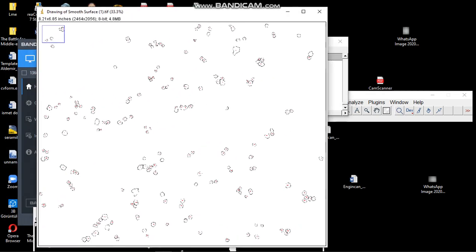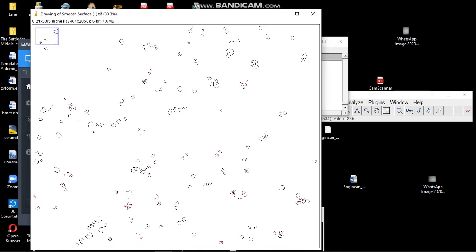Why do we have such differences? We analyzed that in our lesson. In our lesson, as I remember, we had two different specimens in one of the articles, one with a smooth surface and one with a roughness surface, and we were looking at their cell attachment in terms of osteoblast cells. What are osteoblast cells?